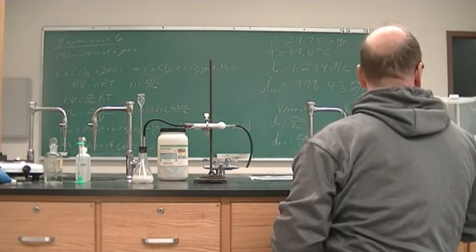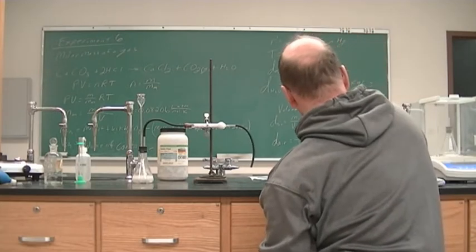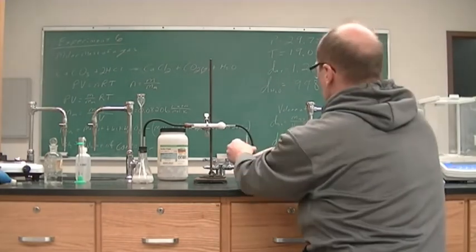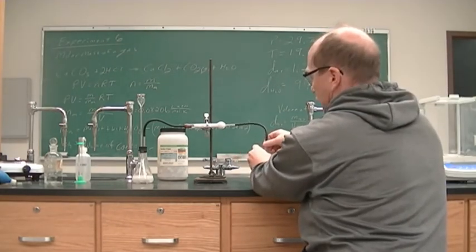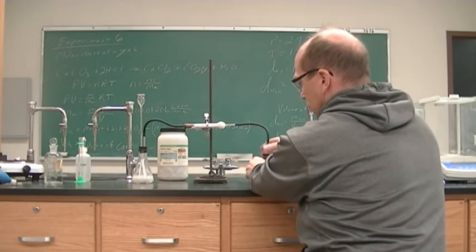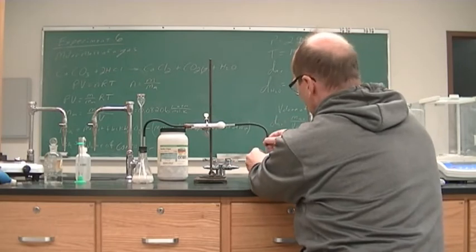And this is 69.2340. Still going up. We'll weigh it again. All right.